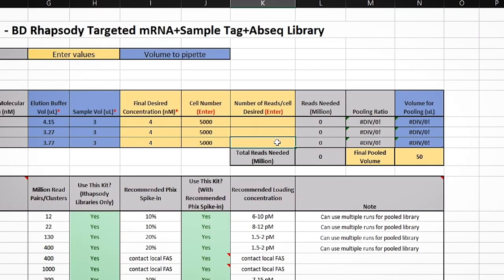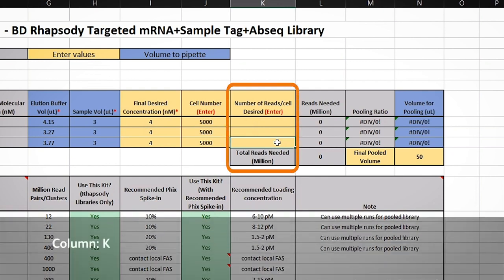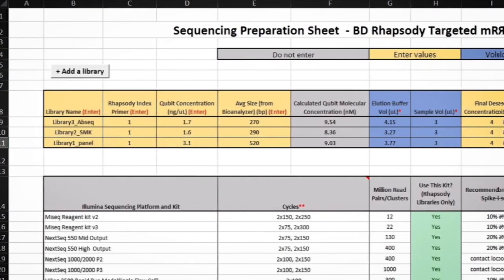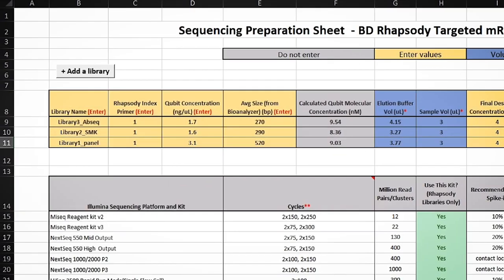Keeping these recommendations in mind, we will input the reads per cell in column K. Be sure to confirm the library type in column B when doing this.